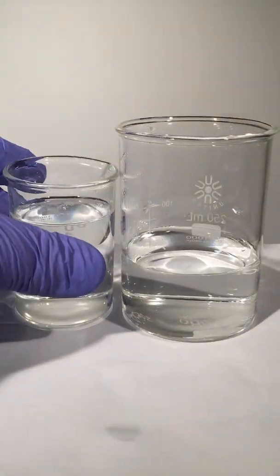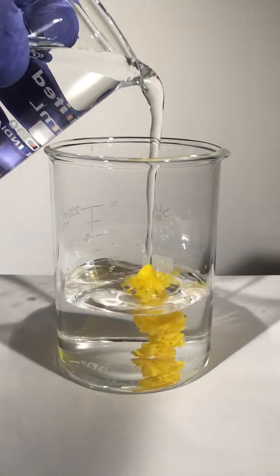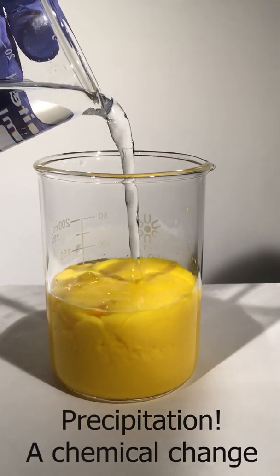But what if we combine them? We can produce a new compound, a yellow precipitate called lead iodide, which is insoluble in water.